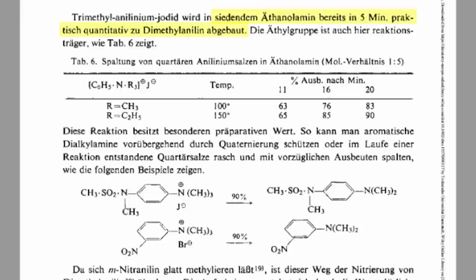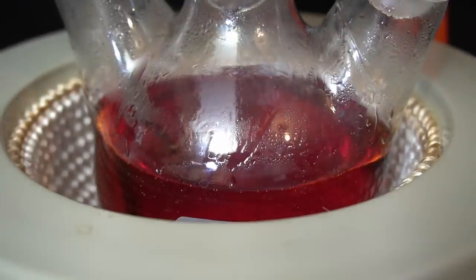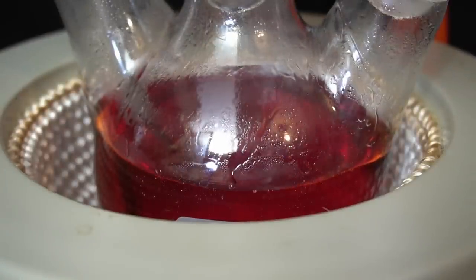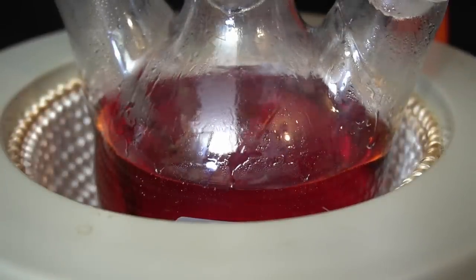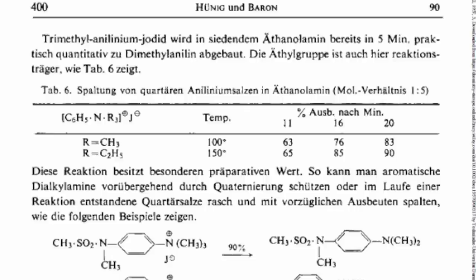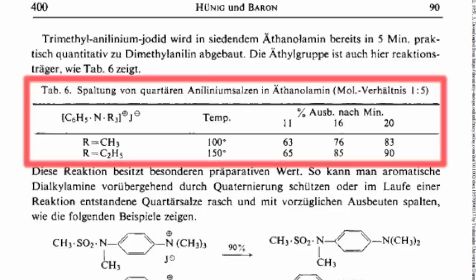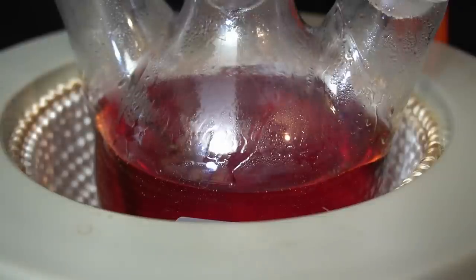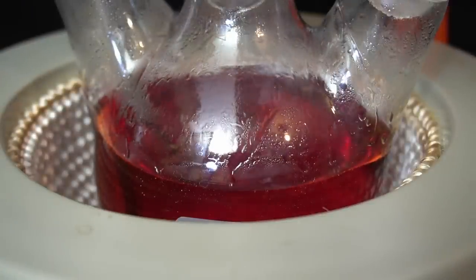But apparently I didn't do that great of a job removing all of the solvent because the mixture doesn't get hotter than 140°C. The reaction also occurs at temperatures as low as 100°C but the reflux time is considerably longer. Therefore I continue refluxing for another 30 minutes.